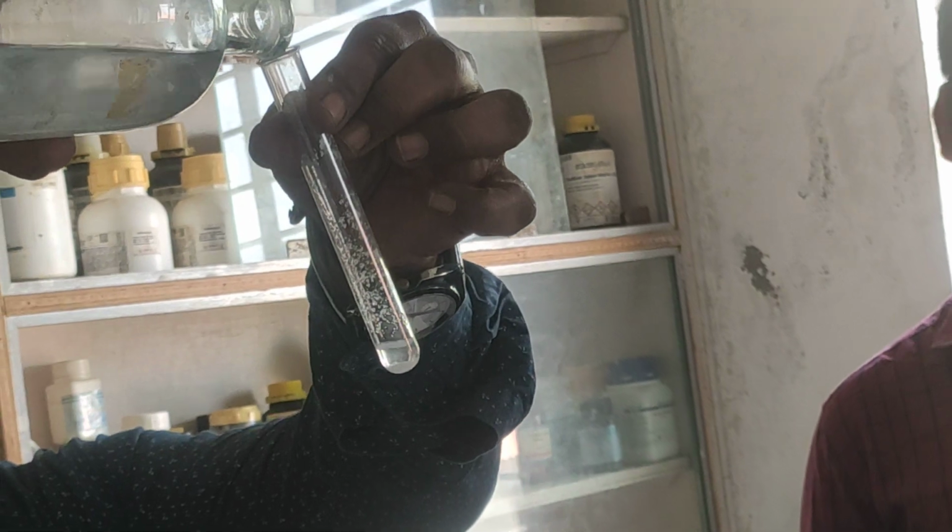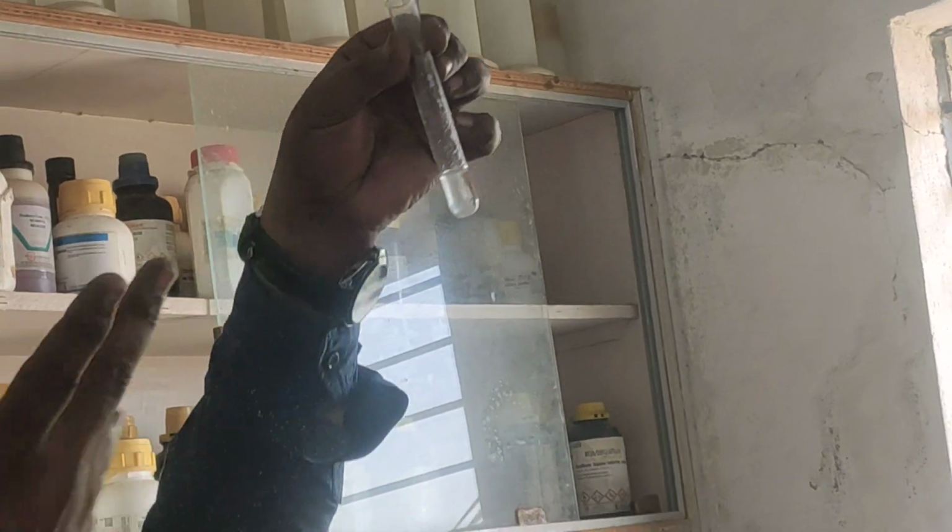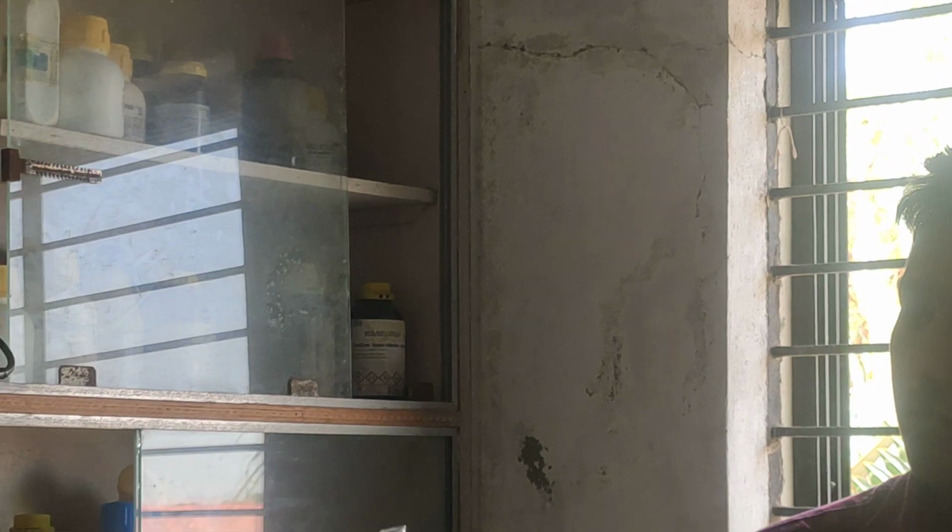Observe carefully. If you observe clearly, you can't see anything here. Is any precipitate there? No precipitate is there. Precipitate means it should settle down here. So nothing is there. Group 3 is also absent.